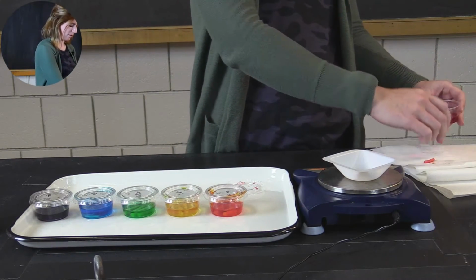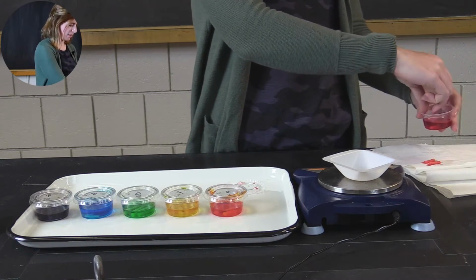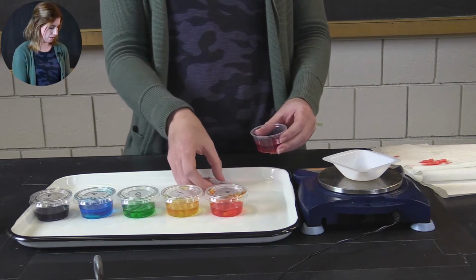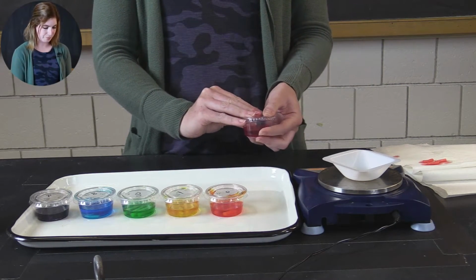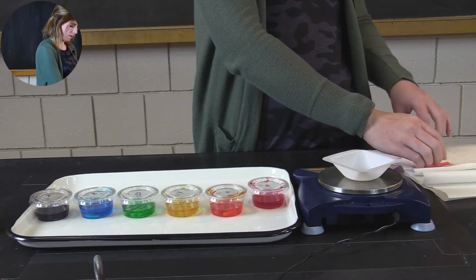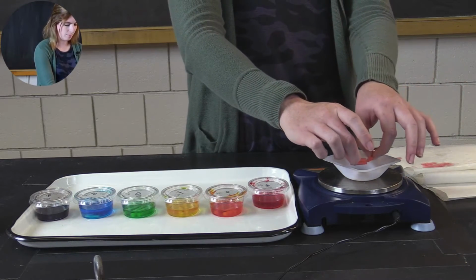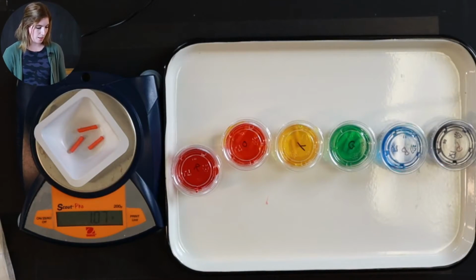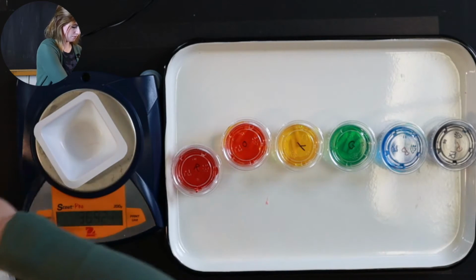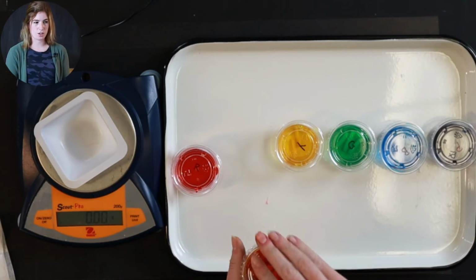They're just potatoes, so I touch them with my hands, it's fine. All right, and I'm just going to let them sit there for a second to dry off a little bit. And then I'm going to place them on my scale. And my scale tells me that my final mass for my red potatoes is 1.07 grams. So I'm going to go ahead and write that down. I'm going to take these off and move to my orange.